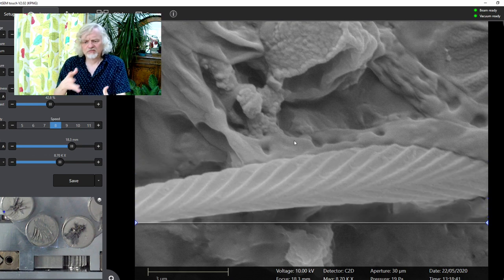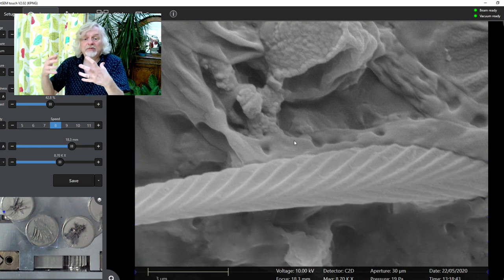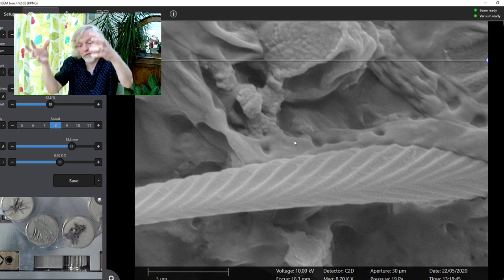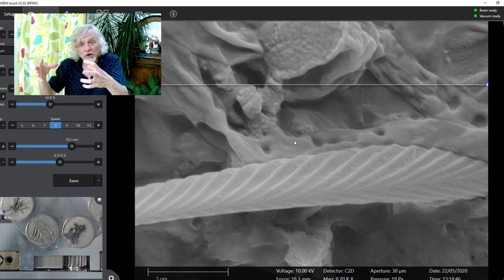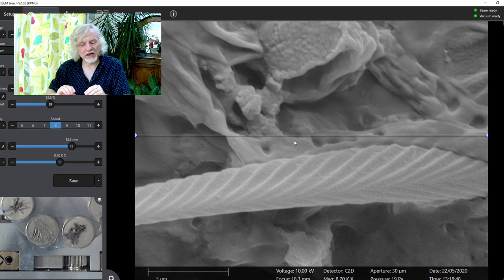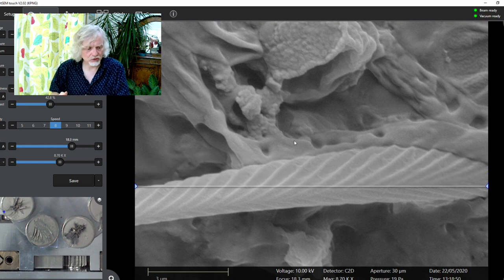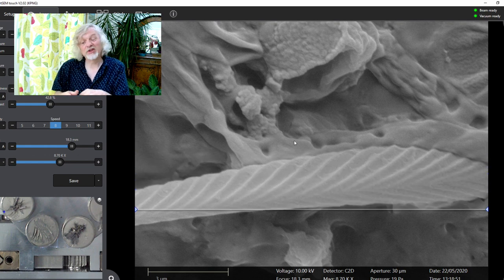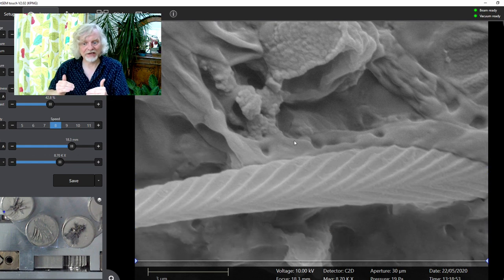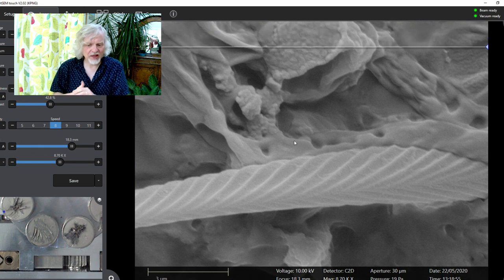So basically what you do is you have the speed set to quite fast. You move around, you find what you're interested in, and then you slow the speed right down and you get better and better imagery. And obviously when you take actual pictures, you slow it right down to nothing. So there you go.